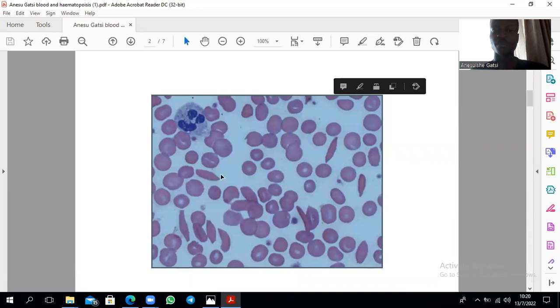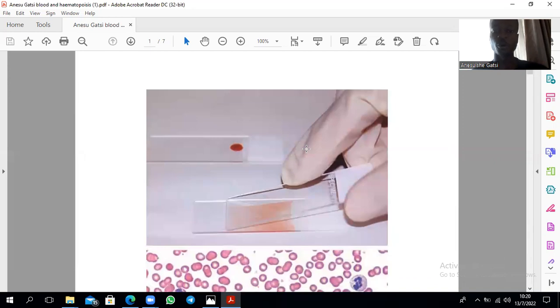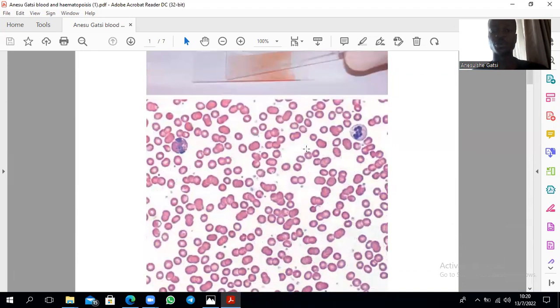Right. And red blood cells, if you remember from your general histology, are considered a histologic ruler because they can be used to approximate the cell sizes of other cells in blood. They have a diameter of about 7.8 micrometers and a lifespan of 120 days, after which they're removed in the open circulation of the spleen. They're also removed by Kupffer cells.